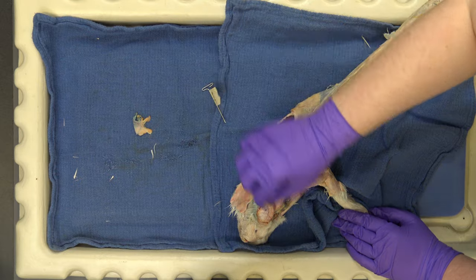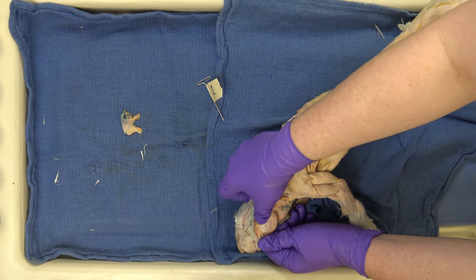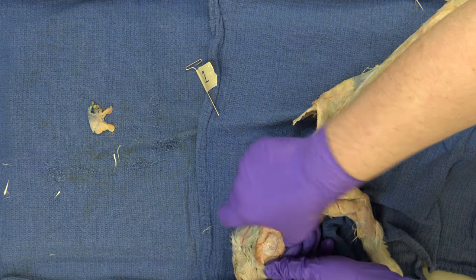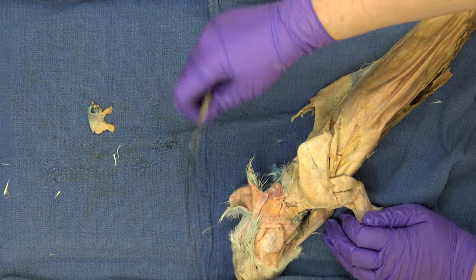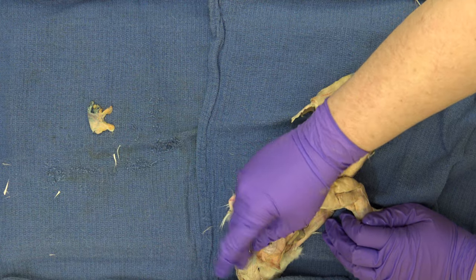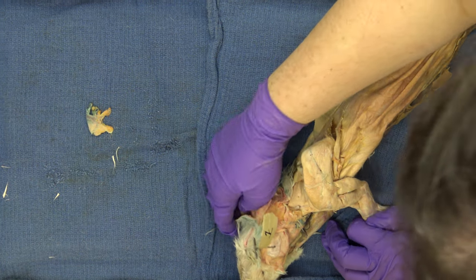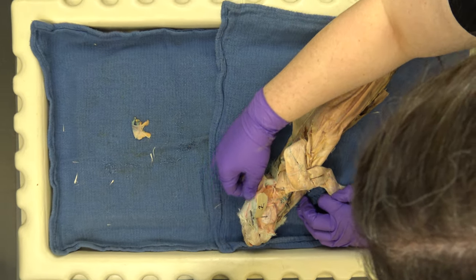Masseter — right here — this muscle is huge. It's big in animals that typically grind, so it's pretty big in the rabbit. The other major muscle of mastication is the temporalis, and you can feel that on your temples if you grit your teeth. That's more of a carnivore muscle; it's not really big in the rabbit, so I didn't bother to try to show it.